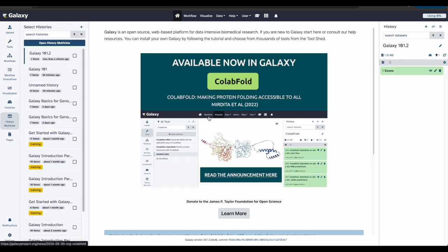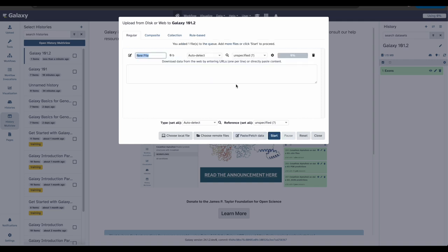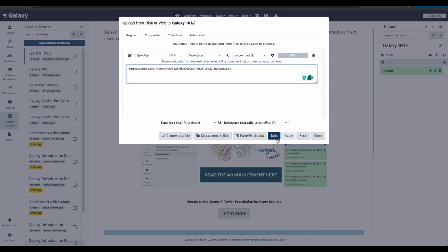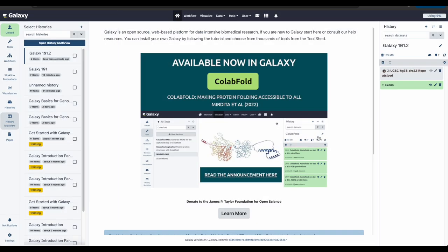Now we need to upload some new data to run the workflow alongside the exons data. To do this, we will do the Paste Fetch option again using the link provided in the tutorial. Again, let's click Upload Data. Go to Paste and Fetch. Paste the file from the tutorial. Click Start and Close.